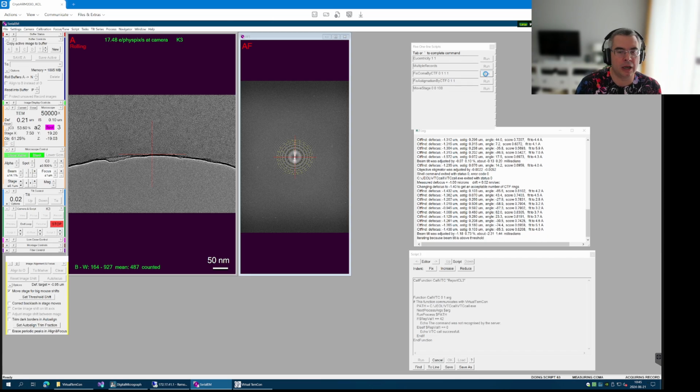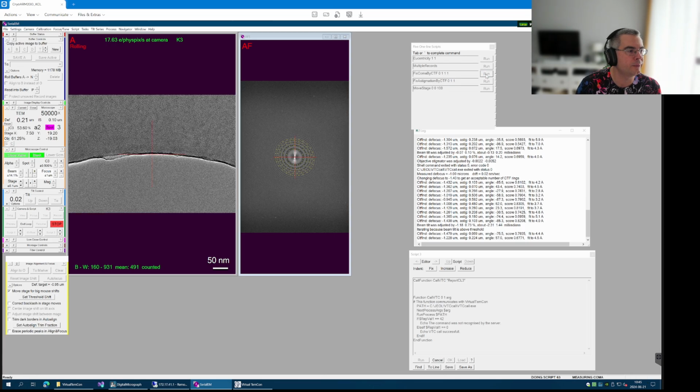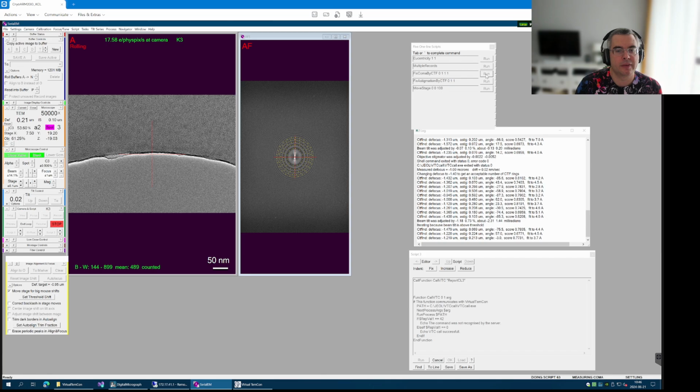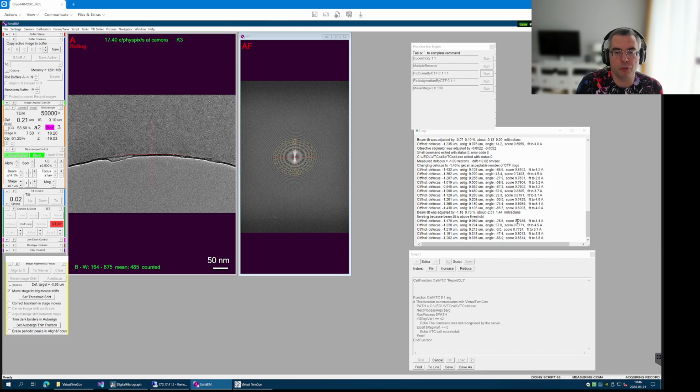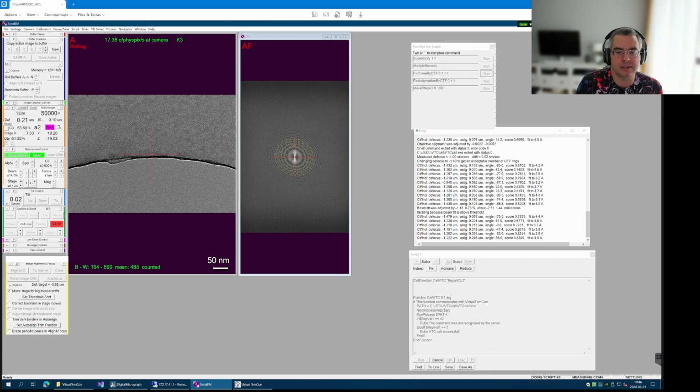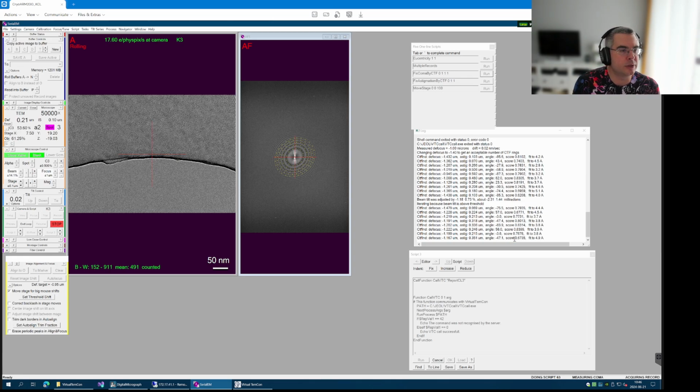Okay, so it has to do it again, because my coma was above threshold. Well, it happens, that's fine. So here are the shots. What I really want to see here is that the score is quite high. So 0.7, 0.8, these are good scores. It means that we are getting a good fit, and the whole procedure makes sense. So this is important.